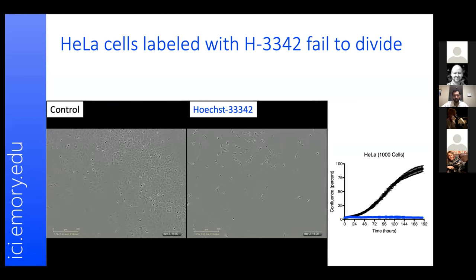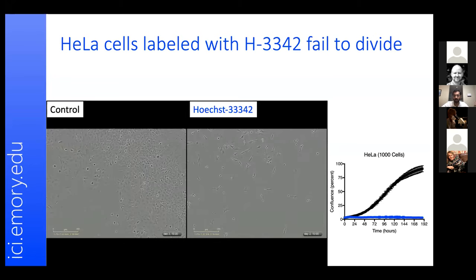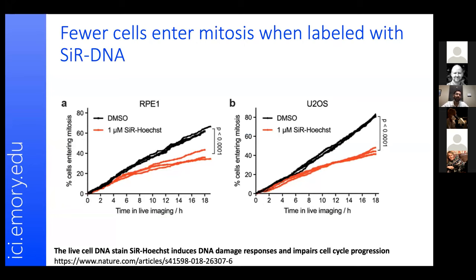The lesson here is it's not just the low wavelength of light that is the problem — I didn't even use fluorescence in this experiment. When Hoechst intercalates with DNA, there are issues. And this is not only relevant to Hoechst: SiR-DNA, which is a silicon rhodamine-based dye and a chemical modification of Hoechst, also intercalates with nucleic acids. In RPE1 and U2OS cells, 1 µM SiR-DNA results in fewer cells entering mitosis compared to controls.